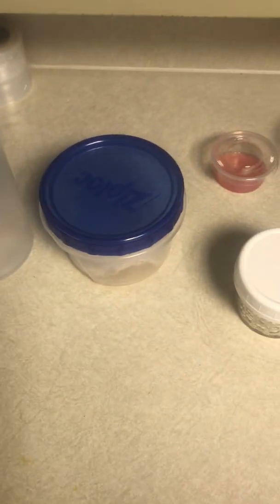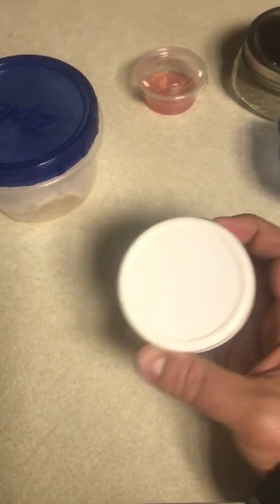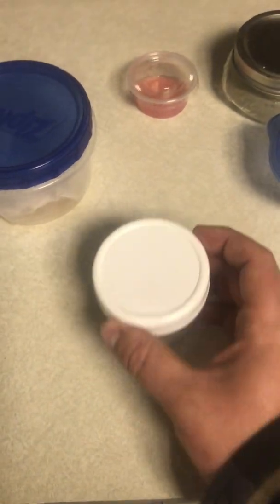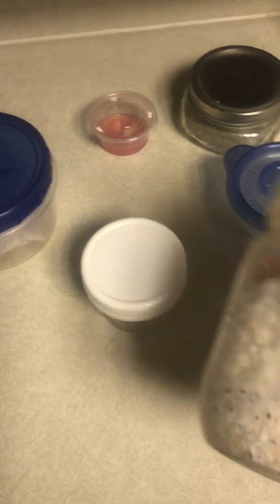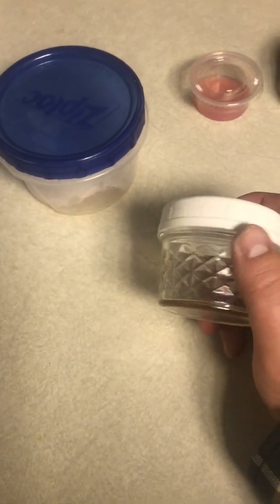When I was first starting out with agar, these little plastic lids were my go-to. They fit the same jars as a grain jar — same lid — so they're just handy. Size-wise they're shorter, so you can fit more in your pressure cooker, and they're not quite as big around but they still do a good job.